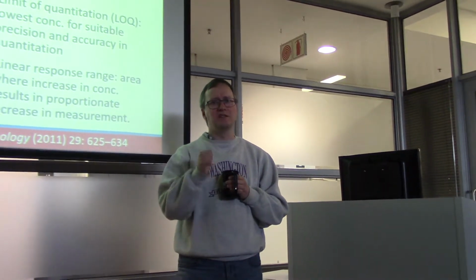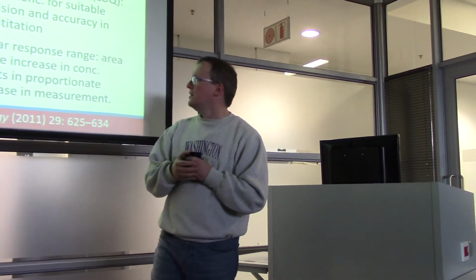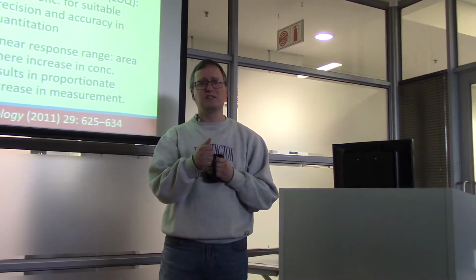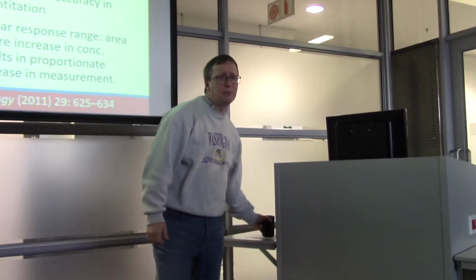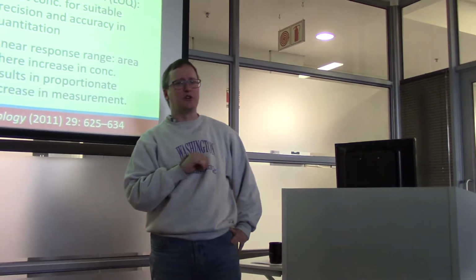And in this case, the output from using that tool is quantitative information. So ultimately, people want to be able to translate mass spectrometric intensity into something like concentration that they can use. And for that, a calibration curve is a very standard way to go. So we have things like limit of detection.